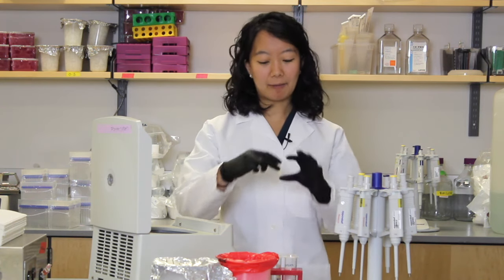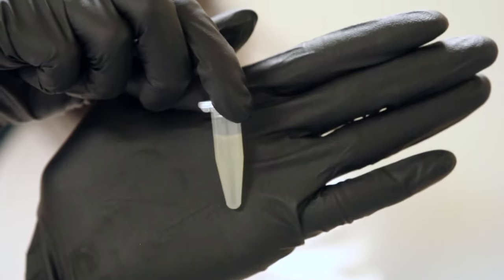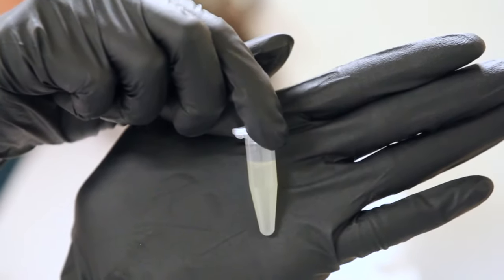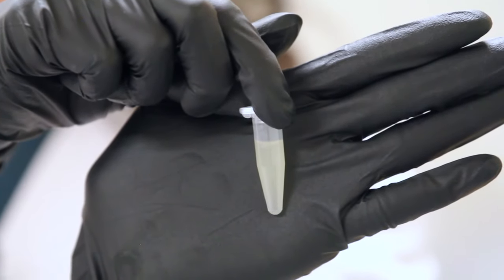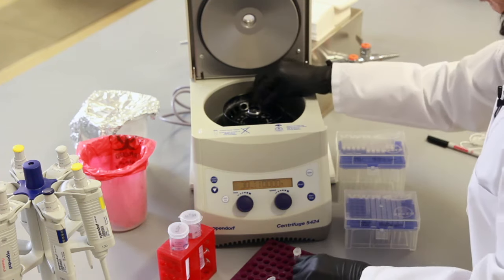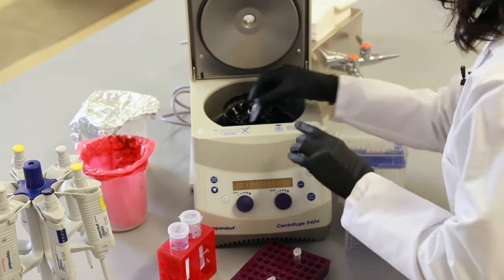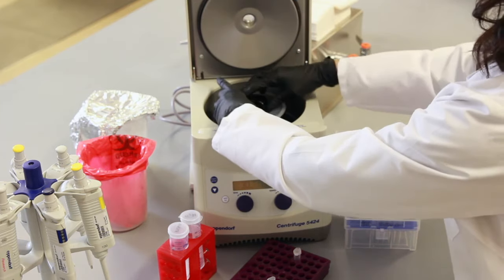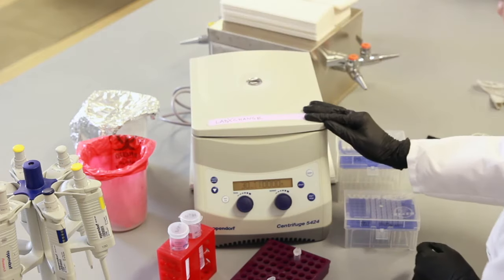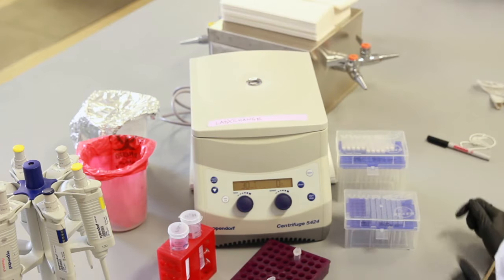The second application of centrifugation that I'm going to show you is separating different particles of different weights within one single solution. I have here a sample that I prepared, which is a sample of some bacteria. And all of the bacteria is currently suspended in the solution. What I want to do is separate out this bacteria from the liquid so that I can resuspend it in something else. I'll pop that into my centrifuge, again with my balance that I've created. And then I can screw on my lid and start the centrifuge once more.